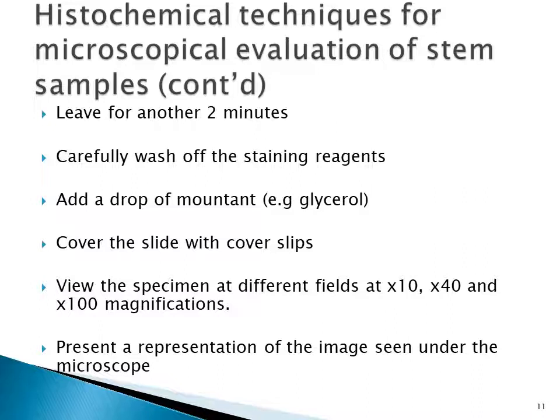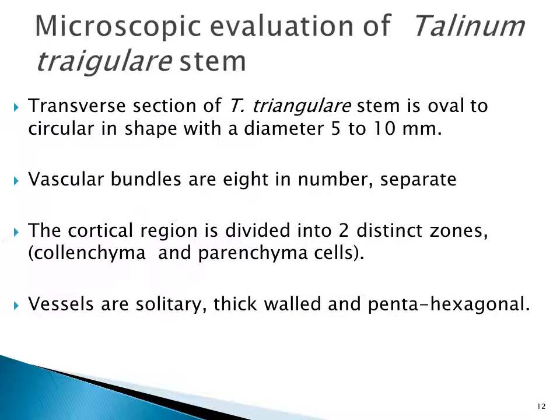And when you are presenting your representation, you have to give 3 figures. Remember, you give the magnification at which you are drawing, the eyepiece, and the objective lens. It is very important.